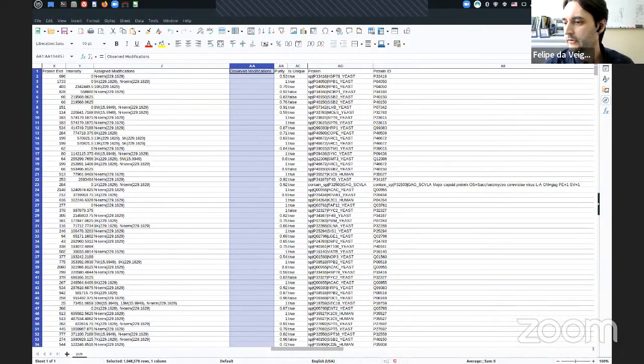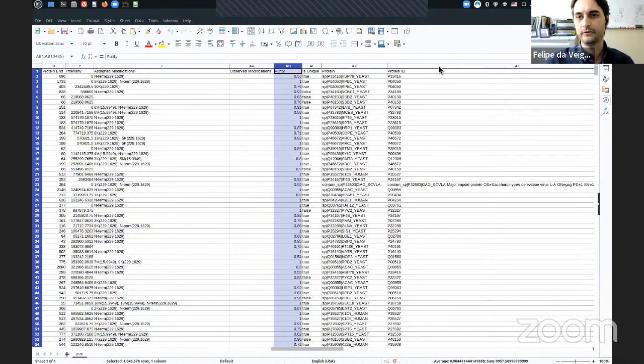We have a question: for TMT workflow, do you have parameters to take into account co-isolation, interference, and SPS threshold? Well, one of the things we use here, and I think it might be related to what you're asking, is this purity score. PD gives you something called an interference column, which goes from 0 to 1, like a percentage. This purity score that we have here is basically the same thing.